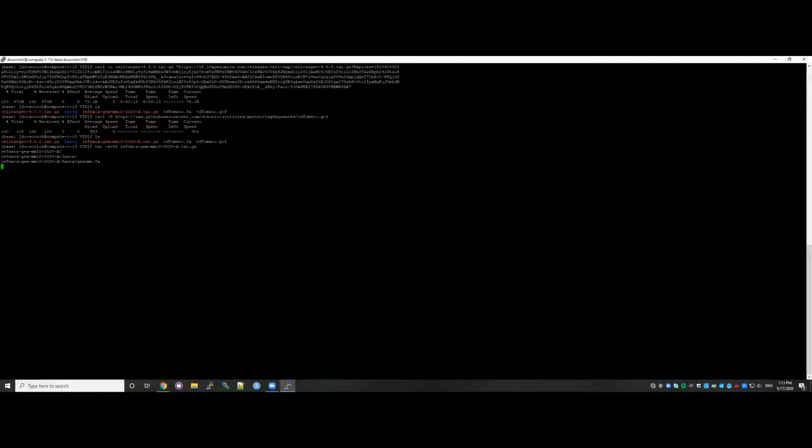So this reference, we decompress it and it will be ready to use for STAR? For Cell Ranger, yes, for STAR. But the point is, it doesn't contain the tdTomato.